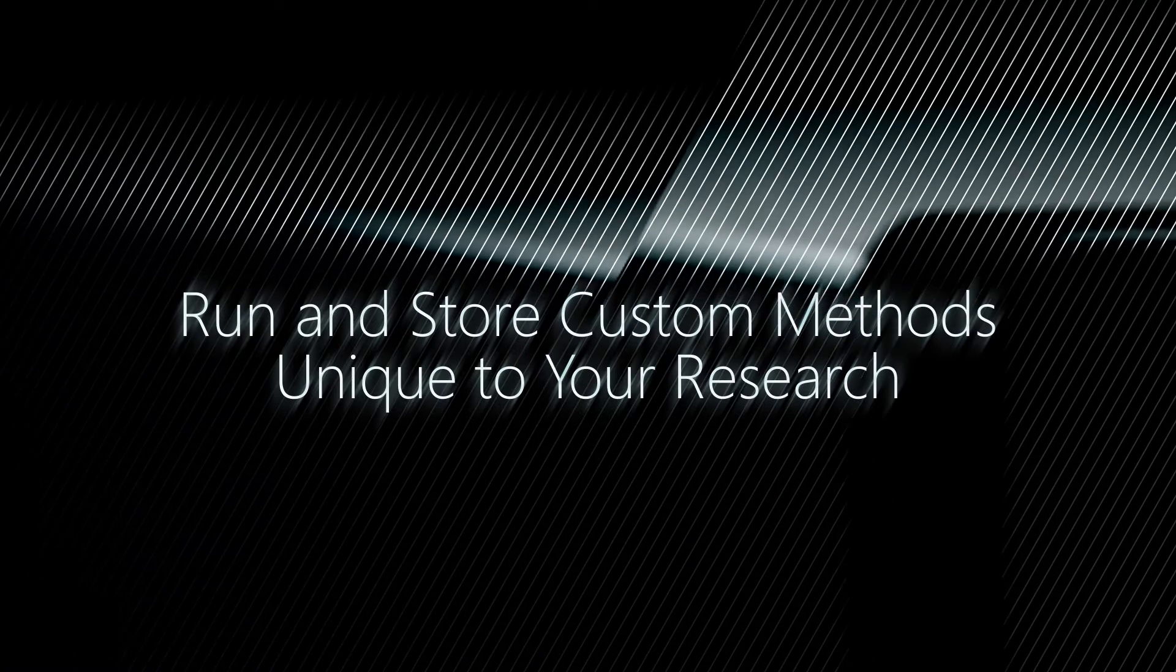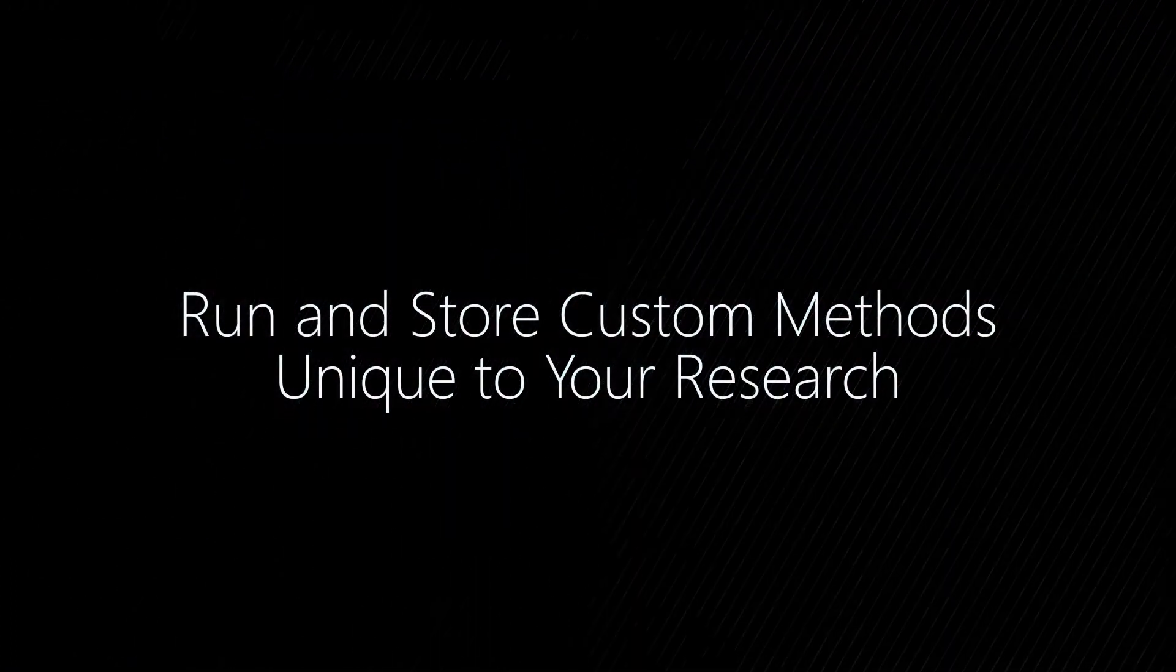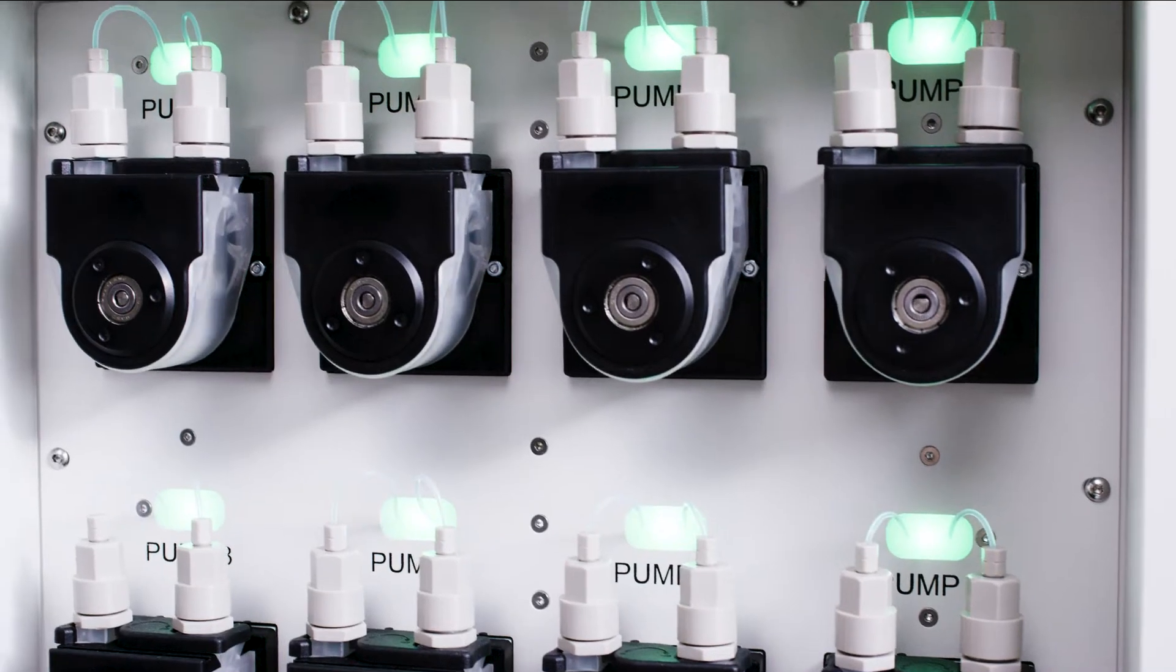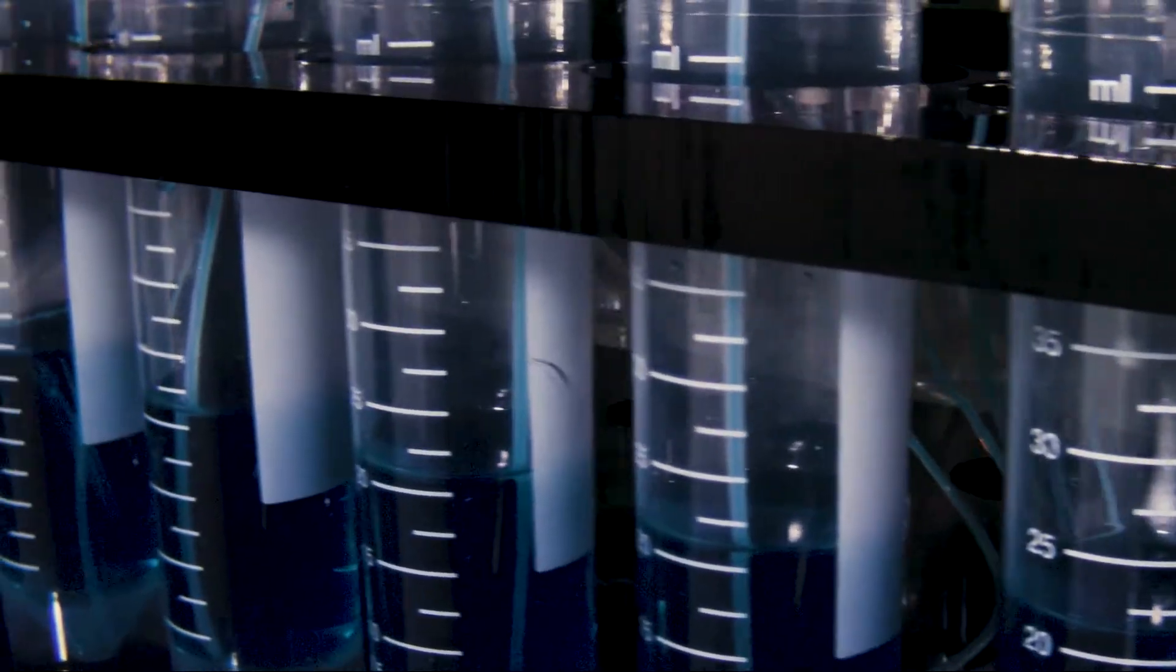You can process 8 individual samples from few milliliters up to liters and extract up to 5 target radionuclides. With a large reagent bay, you can store 12 different reagents.